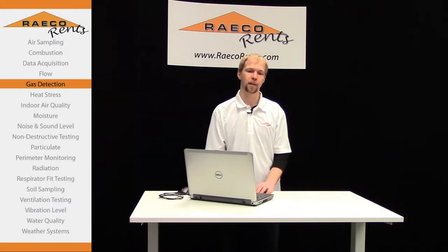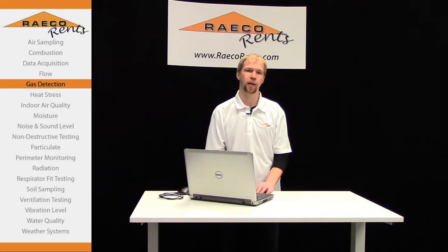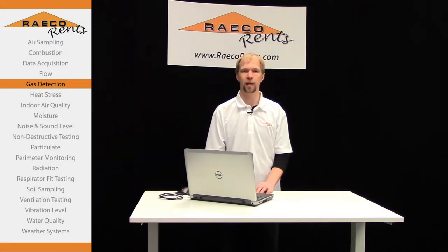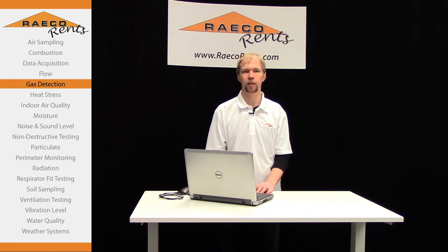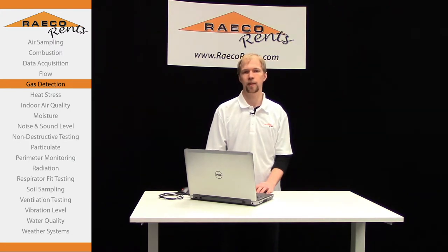Hello everyone! Today I'm going to be doing a quick demonstration on how to load a custom gas library for real-time analysis using the GasMet DX4040 FTIR Gas Analyzer.